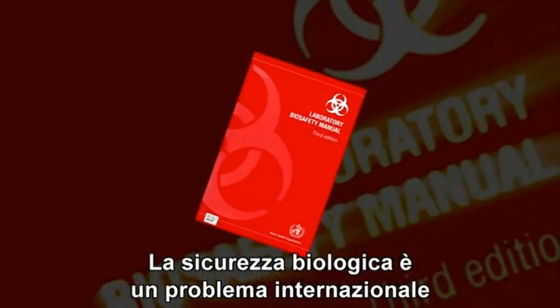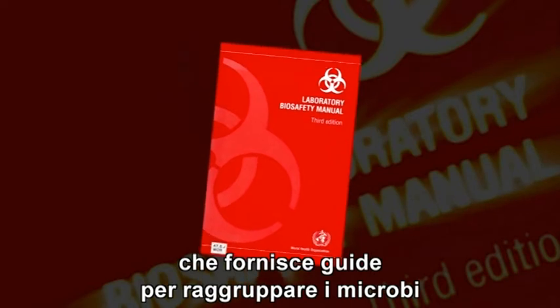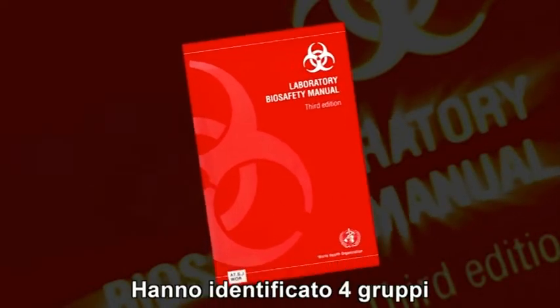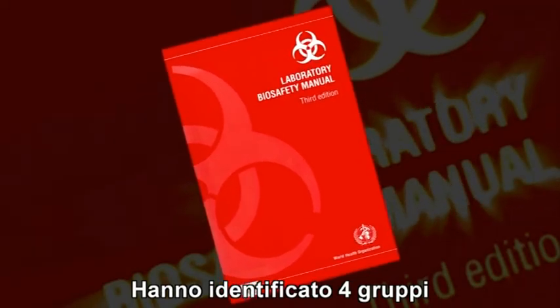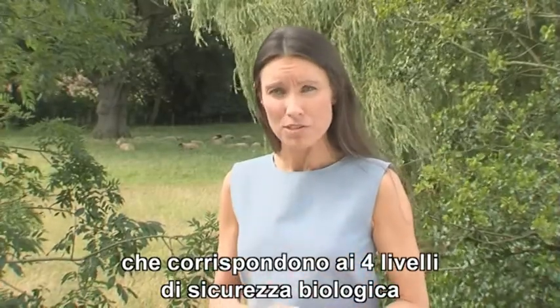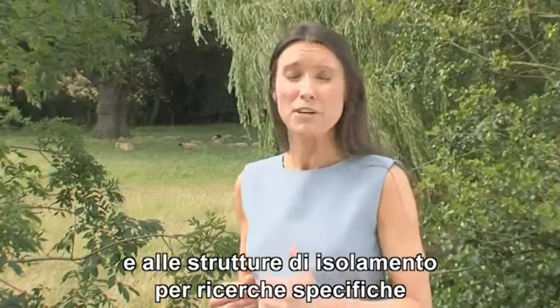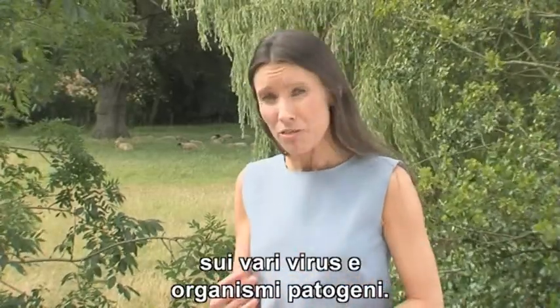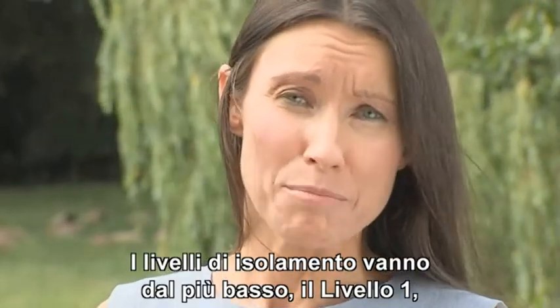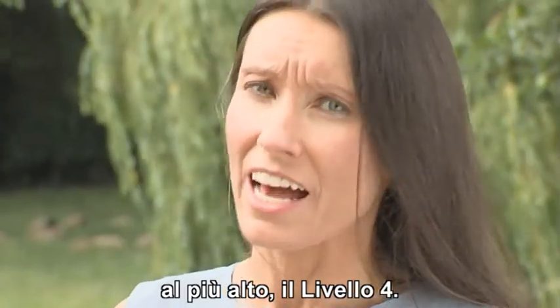Biosafety is an international issue and high on the agenda of the World Health Organization, who provide guidance on the groupings of microbes according to their risk or hazard level. They've identified 4 risk groups. These risk groups translate directly into the 4 levels of biosafety and the containment facilities designed for specific research into various pathogenic viruses and organisms. The levels of containment range from the lowest, biosafety level 1, to the highest at level 4.